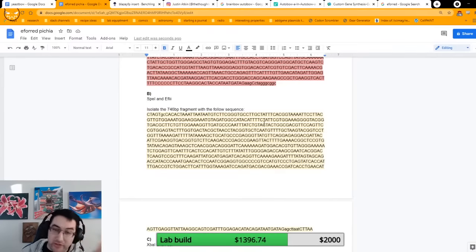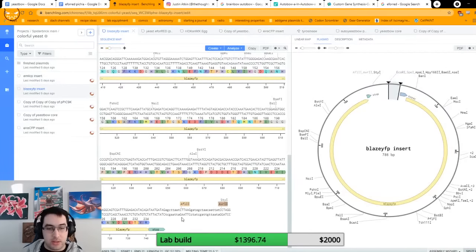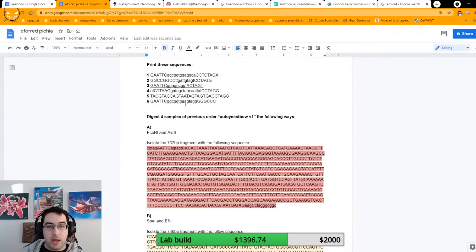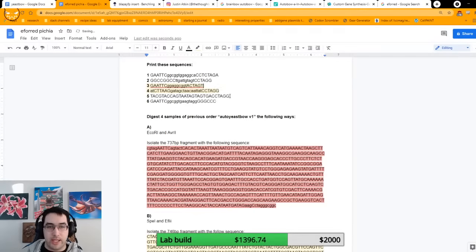Okay, so this is the problem when I'm trying to get them to do something complicated like this. It's a frickin' mess, and just keeping track of everything is annoying. So I really should have taken more care with that. Let me just double check something. Yeah, CTT, AAG, yep, that's correct. AflII, yep, that's correct. Okay, so these two, so that I don't forget, I'm going to highlight in a lovely yellow.